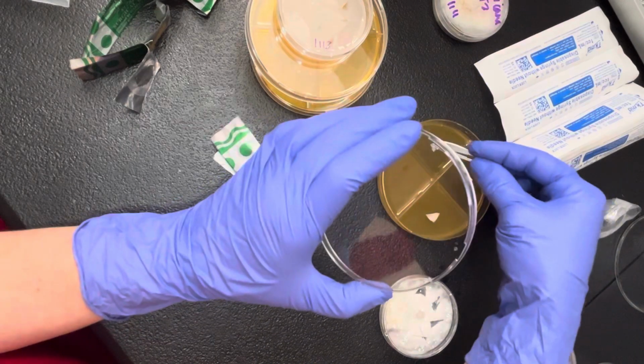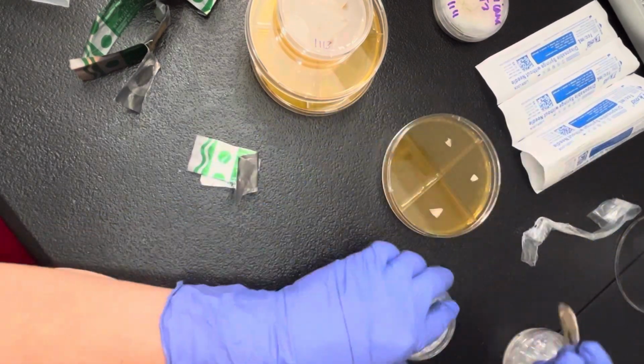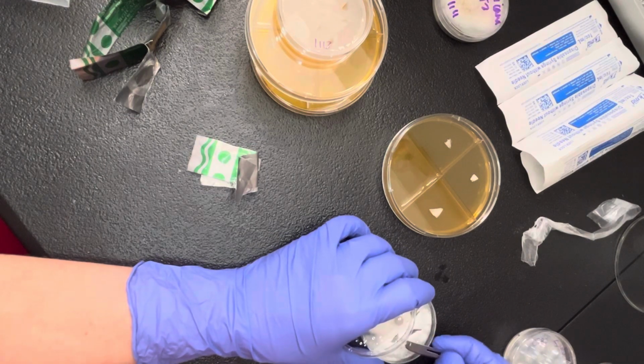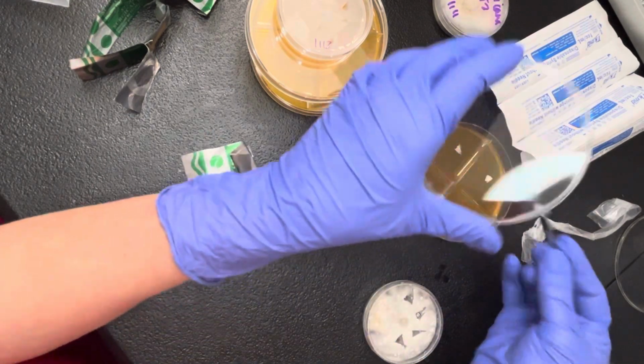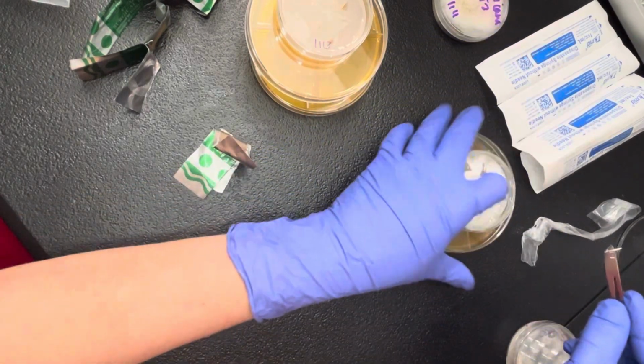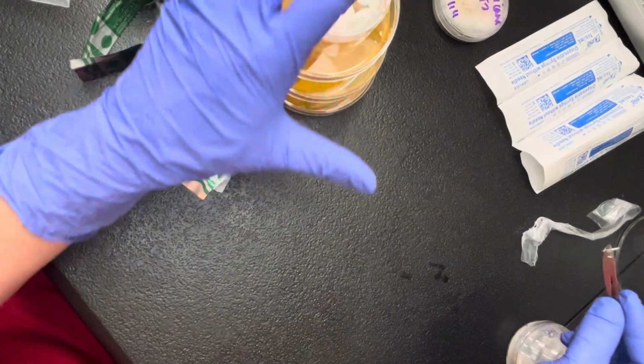I am using a different scalpel blade between samples. I'm not bothering to flame sterilize, just for the sake of time. I'm stacking these like this so I can label them and seal them up after.